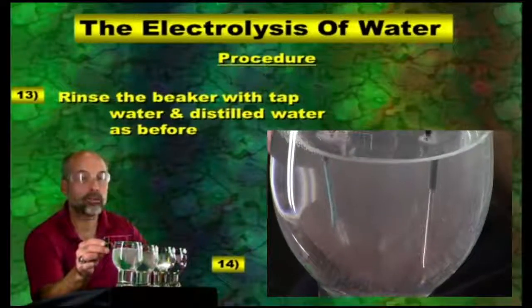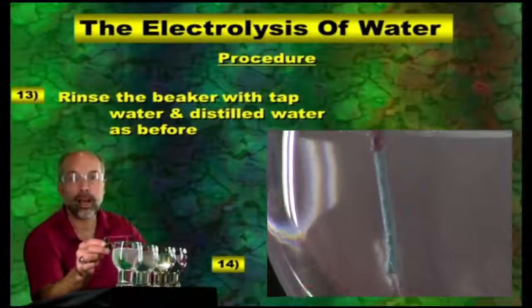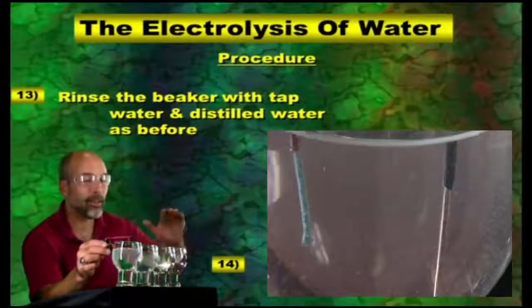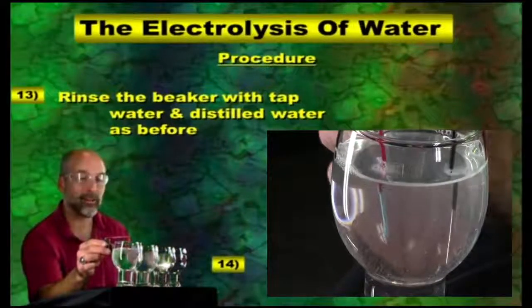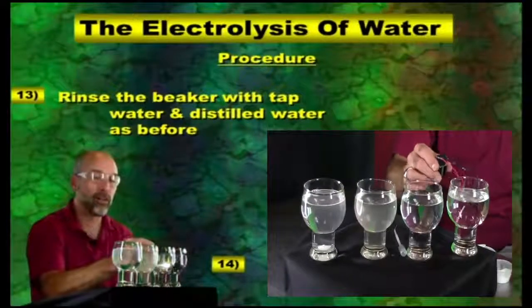The covalent, we'll talk more about this down the road, is going to be the side that helps to break down some of those tough stains like your blood and your grass and some of those things that we have on our clothing and we want to get rid of. So isn't that interesting? We have covalent, ionic, covalent, ionic. Now there's one other thing I haven't talked about that is kind of interesting, and I'm going to pull it out of here. Let's go ahead and rinse it off just a little bit. So again, we get that stuff off of here.